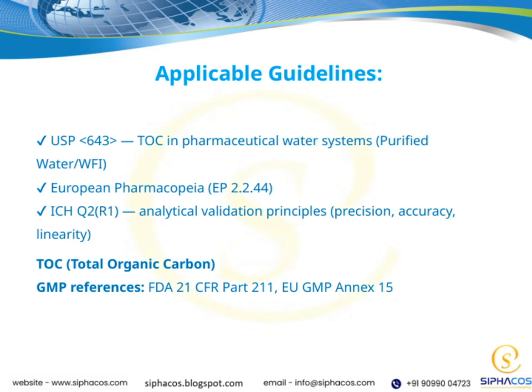These regulations provide a solid framework for maintaining consistent water quality across different regions. Then there's the ICH Q2R1, which outlines the principles of analytical validation, things like precision, accuracy, and linearity. These principles are essential because they ensure our methods are reliable and reproducible.